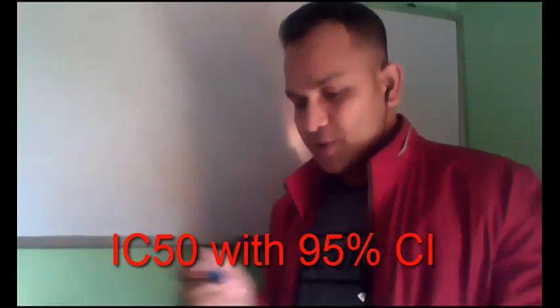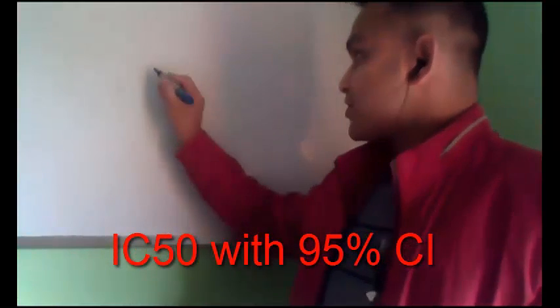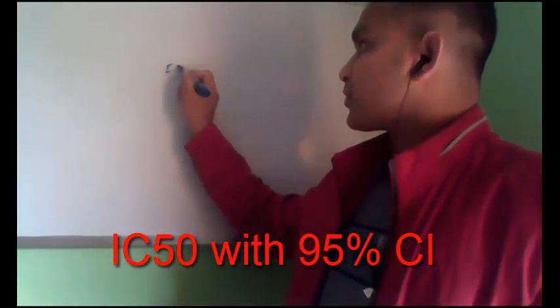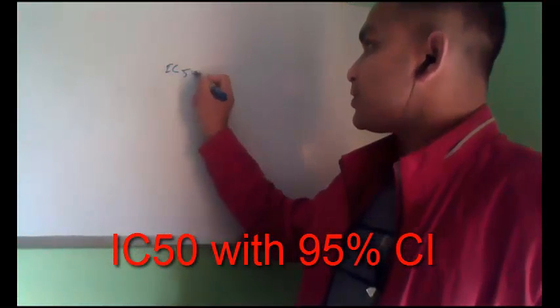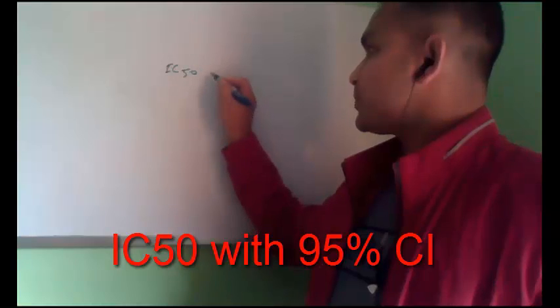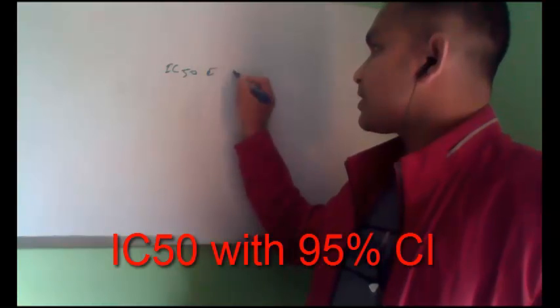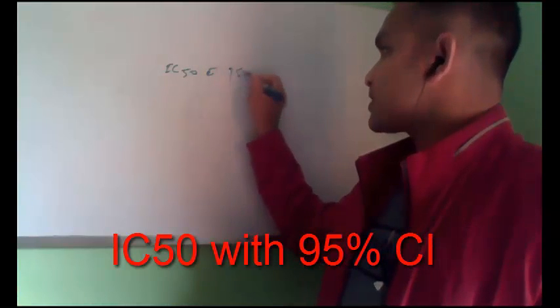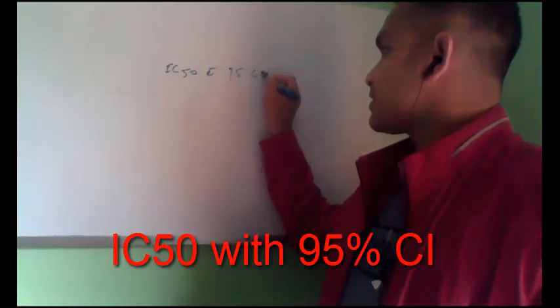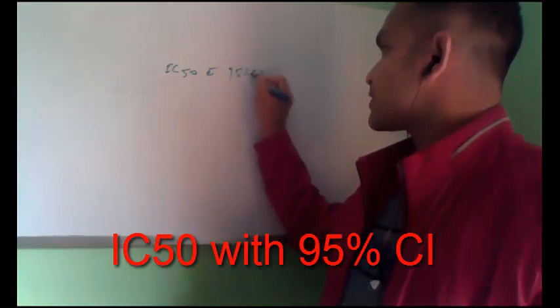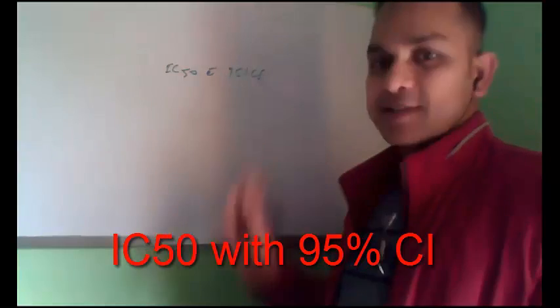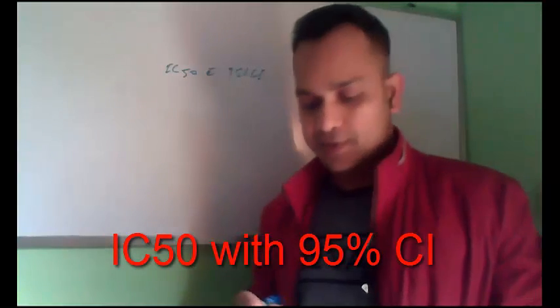Today I show you how to calculate IC50 or LC50 with 95% CI. This is very important.